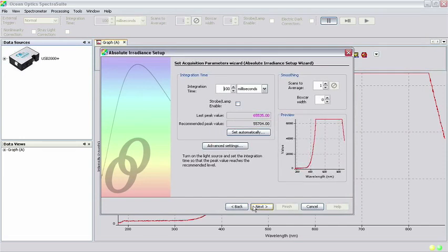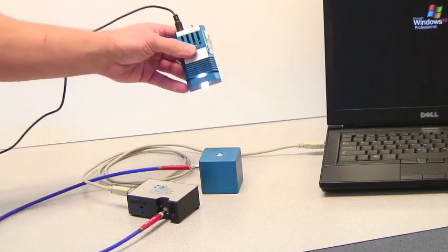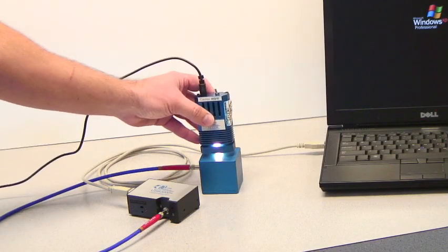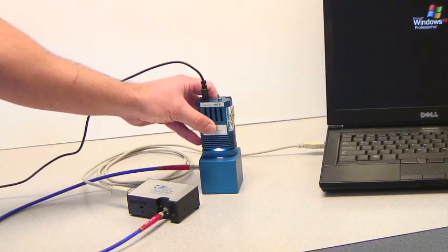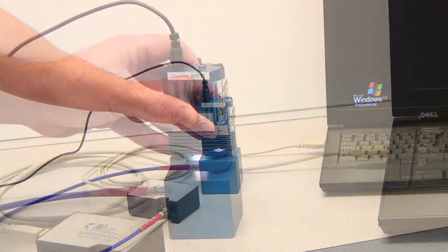Before we set the acquisition parameters, we need to place the LS1Cal-INT diffuser plug into the sample port of the integrating sphere.